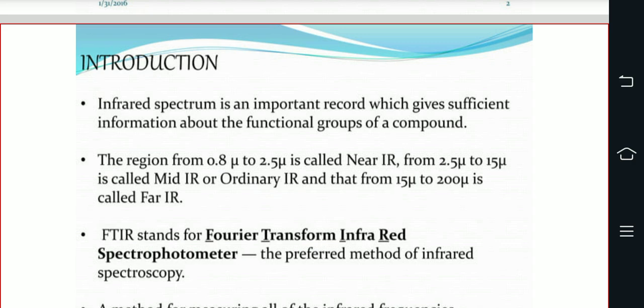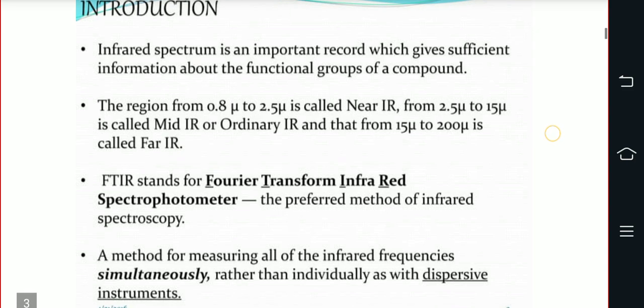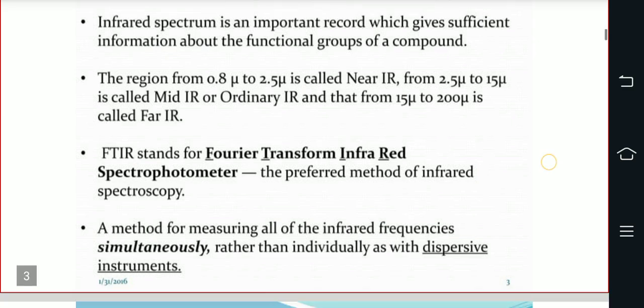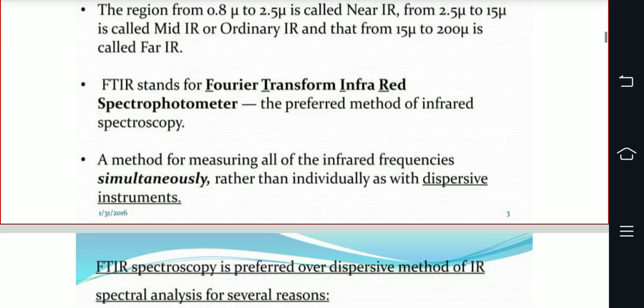FTIR stands for Fourier transform infrared spectrophotometer, the preferred method of infrared spectroscopy, a method for measuring all the infrared frequencies simultaneously rather than individually as with dispersive instruments.